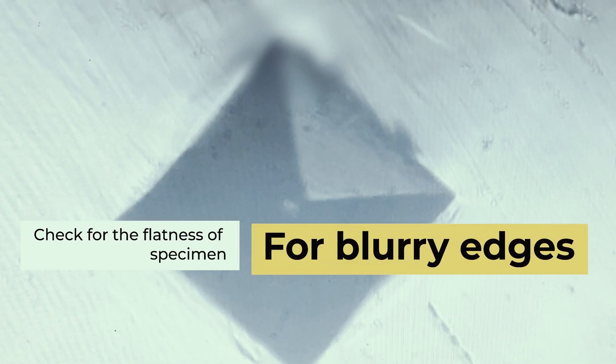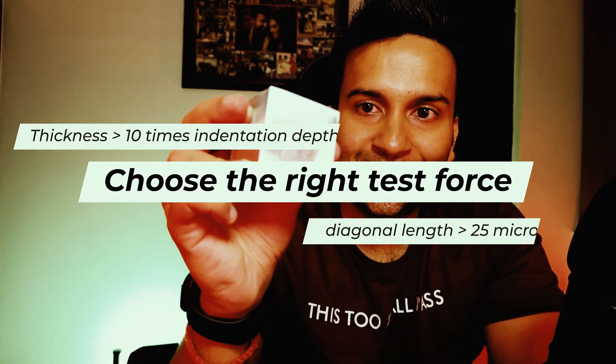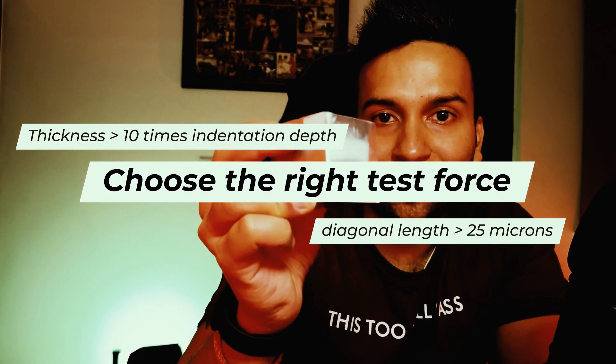If the corners of the specimen are not in focus, check if the sample is perfectly flat. The thickness of the sample should be at least 10 times the depth of indentation — and we have got that covered.